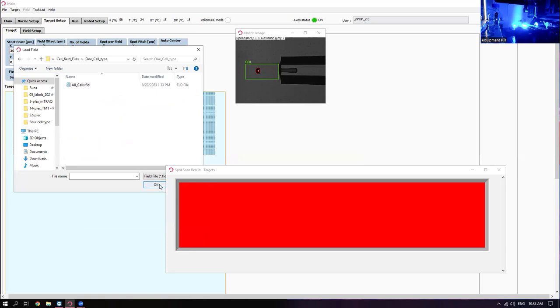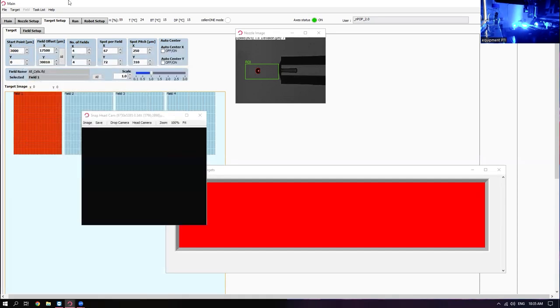If you really wanted to automate it, we can automate it more for you. But we find that people are preparing their cells, and they're going to set different, maybe isolation parameters for each cell type. So automating it doesn't really save you that much time. So this will be for all cells.